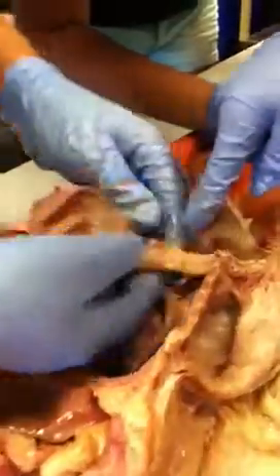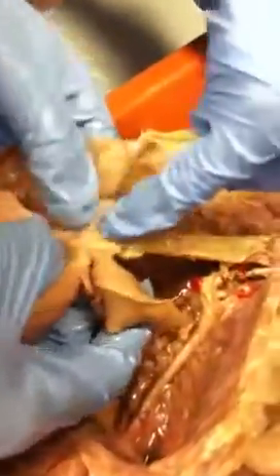Oh wow, you can see how it branches off into the tube right there. That's what we were looking for — yeah, that's cool. What's that called, Ken? Bronchi. No, no, like the thing — like the alveoli?